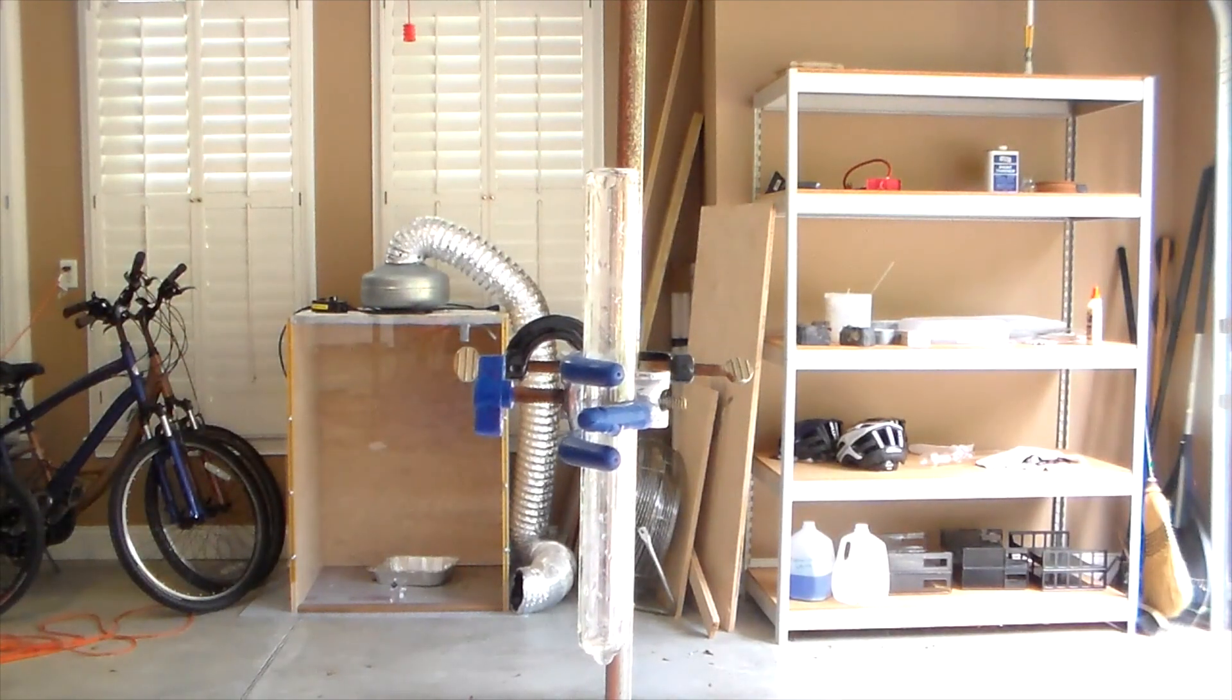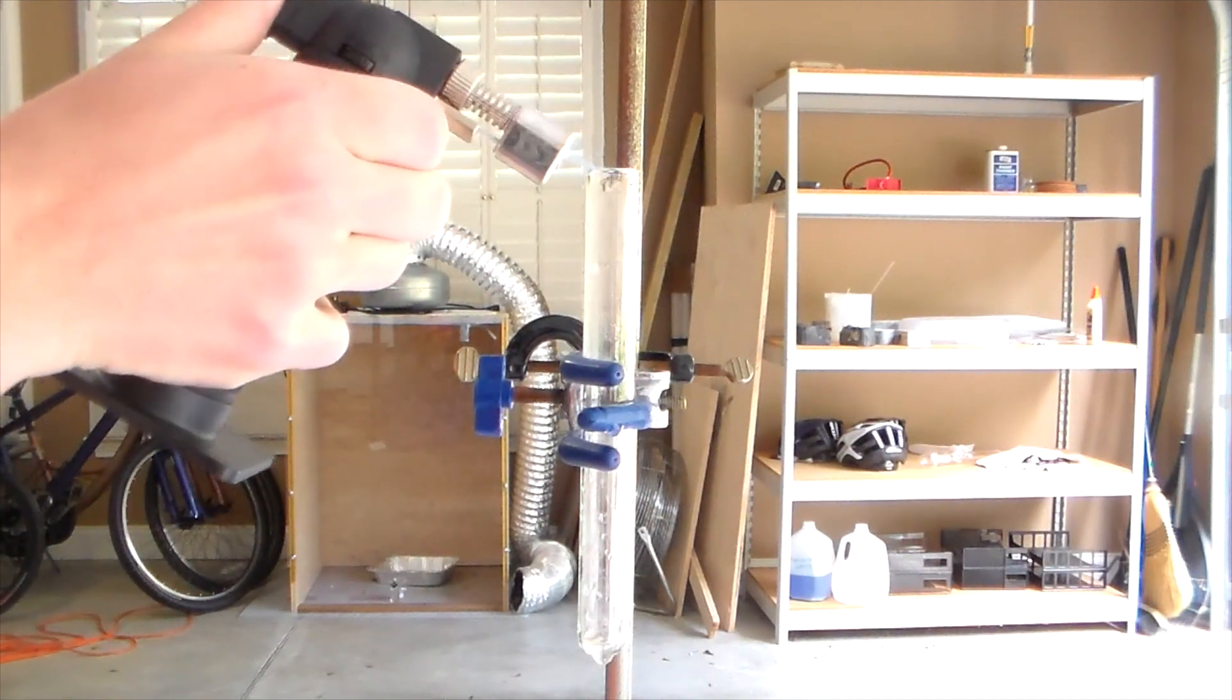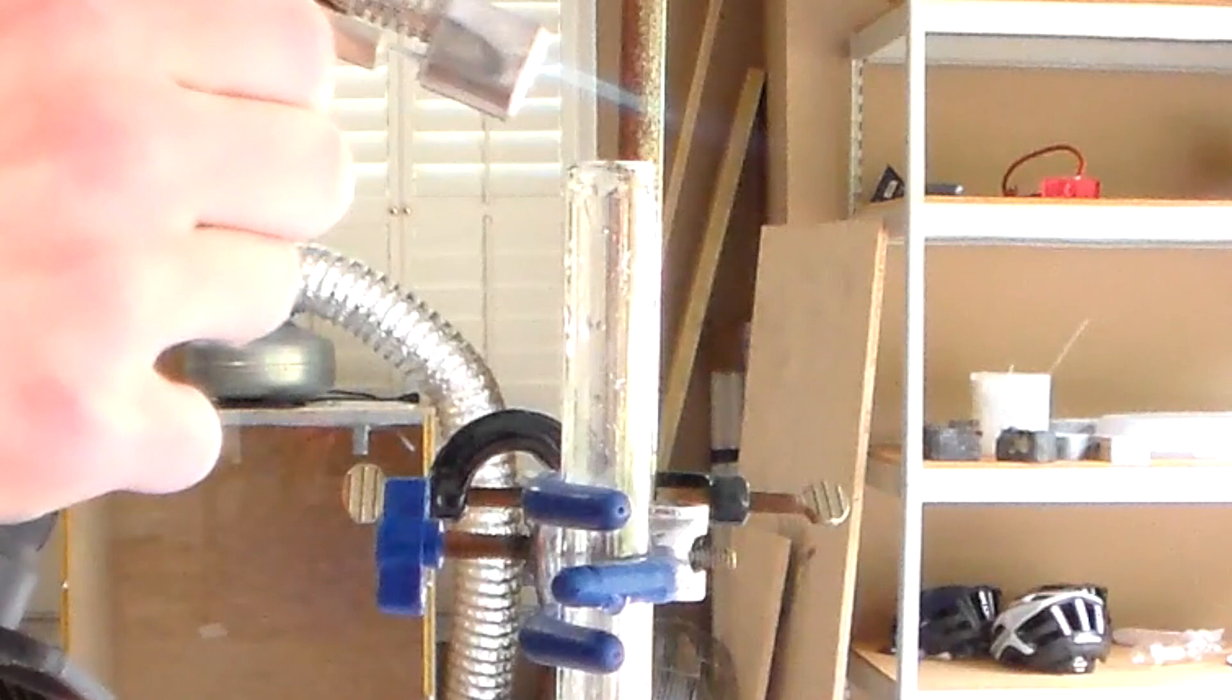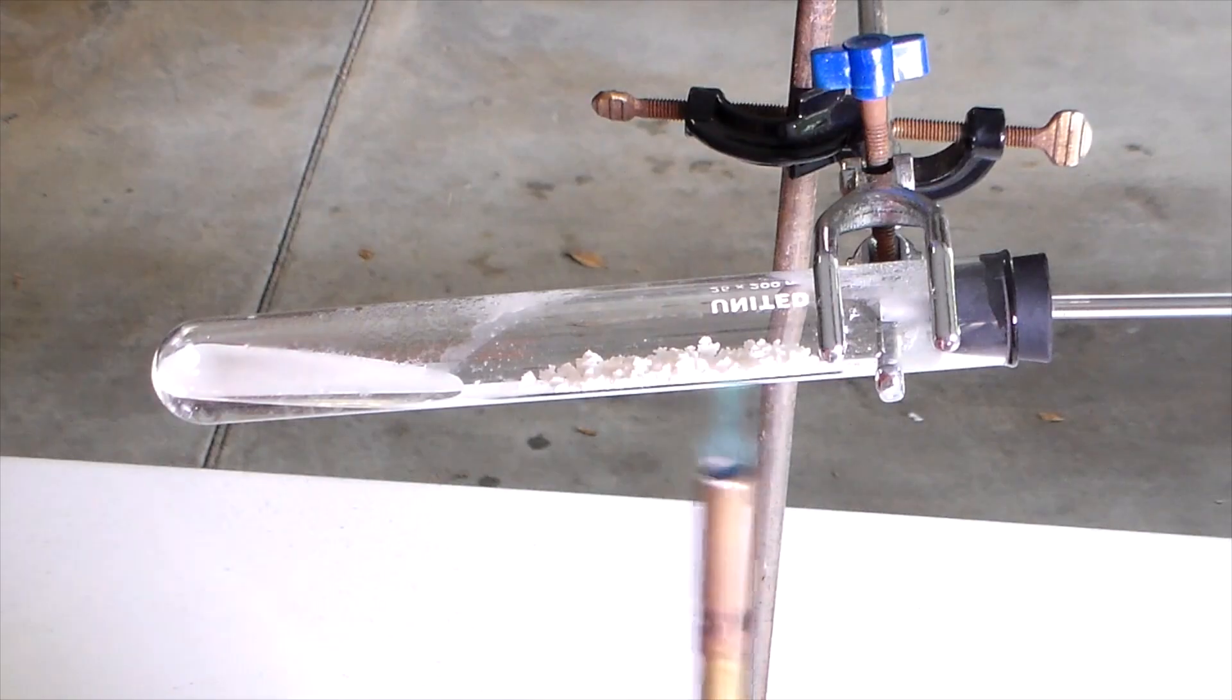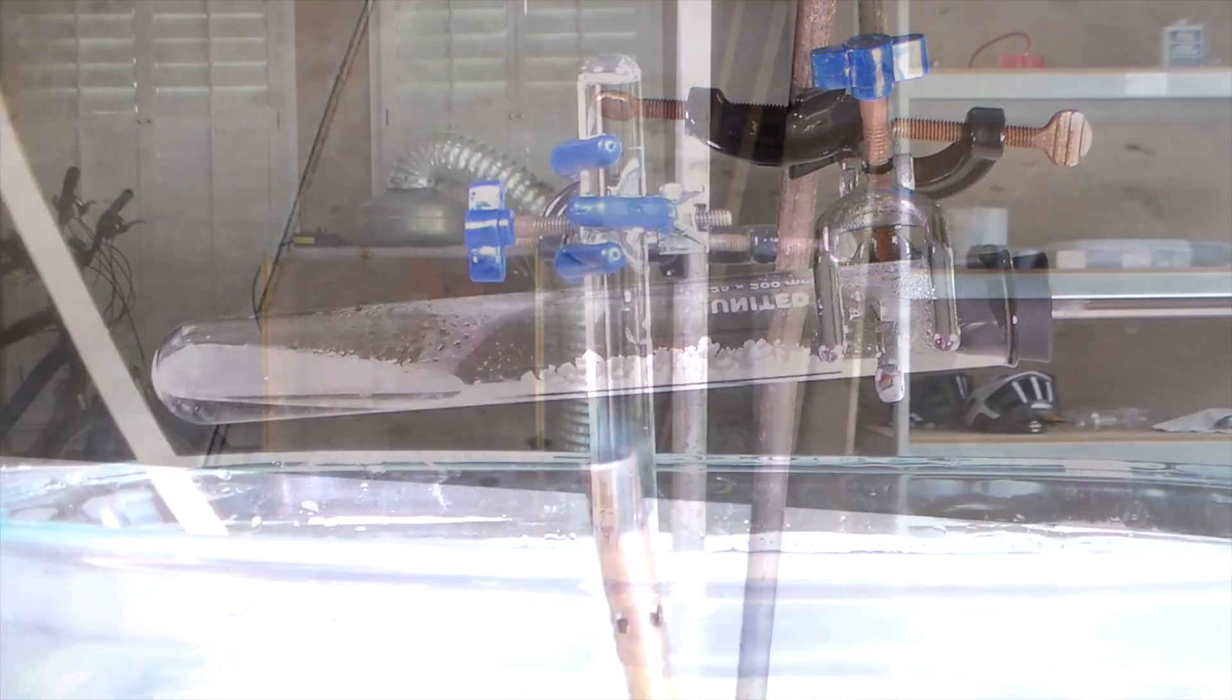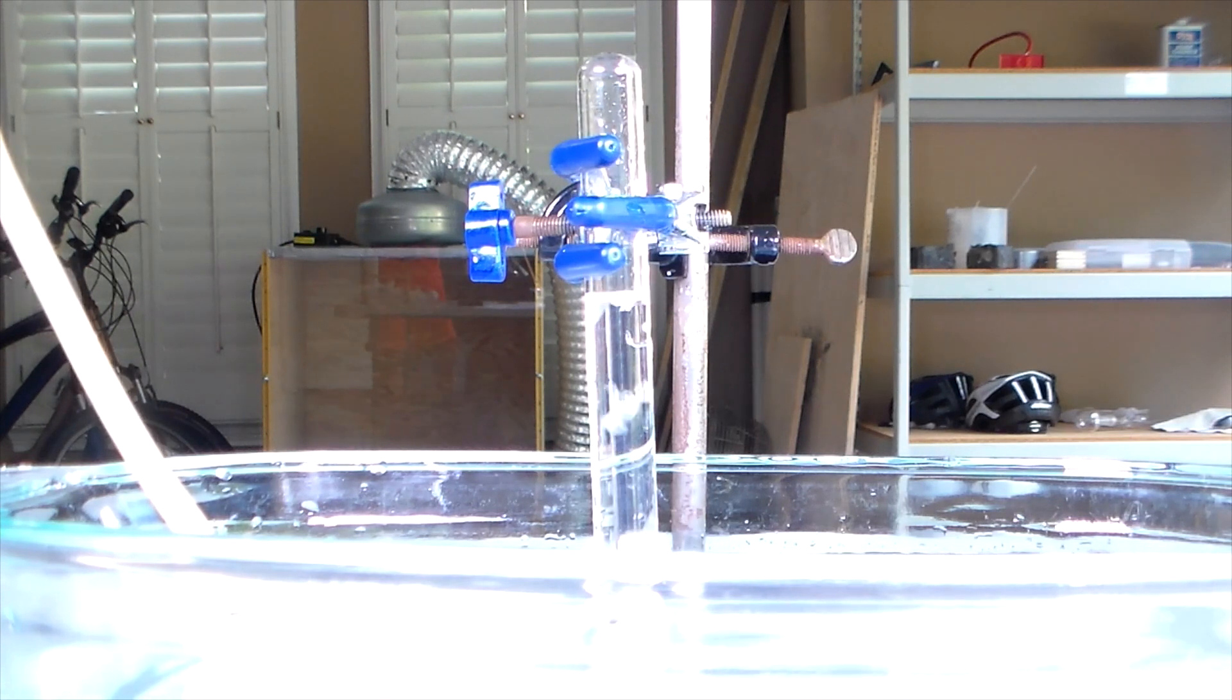Anyway, we can show that we've made a flammable hydrocarbon by testing for flammability. I did this experiment again and collected another test tube full of ethene.